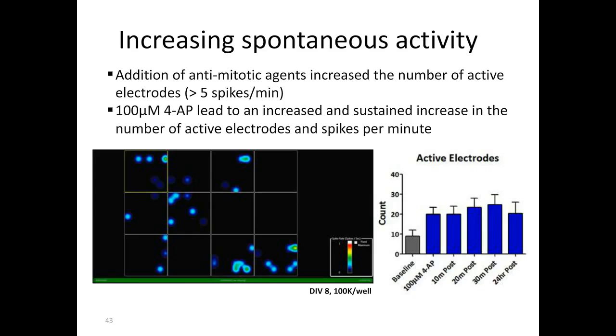in terms of having a big enough window in terms of activity that we could push the activity higher or push the activity lower to really test the effects of either inhibiting or increasing spontaneous activity within the DRG cells.